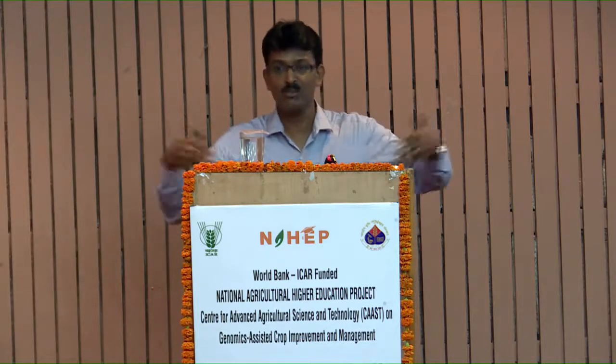Now another question is why people do PCR only 35 to 40 times, why not 100 times, or why not 10 times? Any answers for that? The answer is whatever you are adding in the PCR mix is self-limiting, and after some time it gets depleted, correct? There would be a shortage of dNTPs, because you put some fixed quantity of dNTPs, right? So no longer is somebody going to supply it permanently.